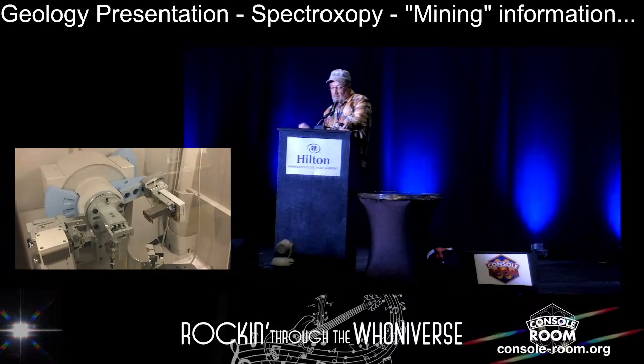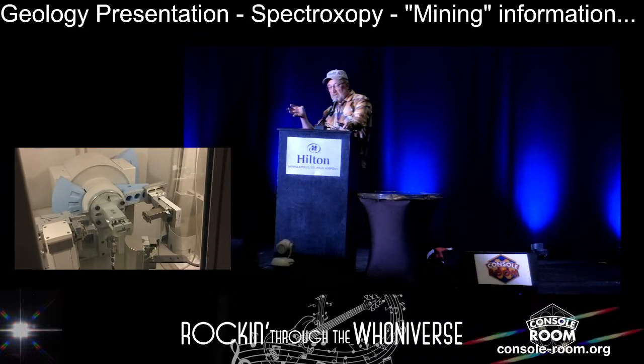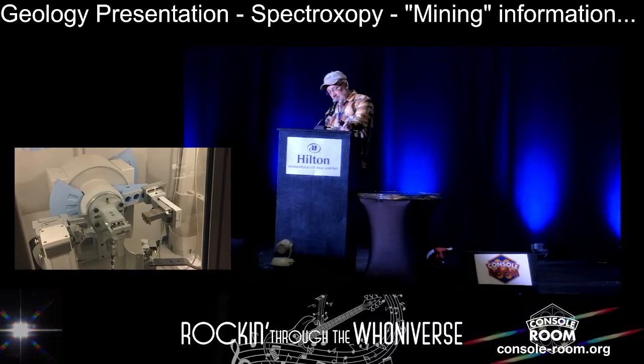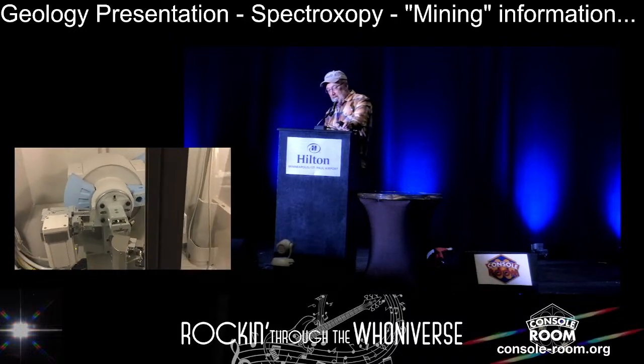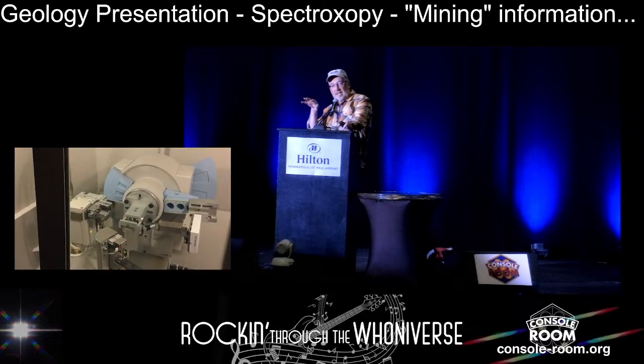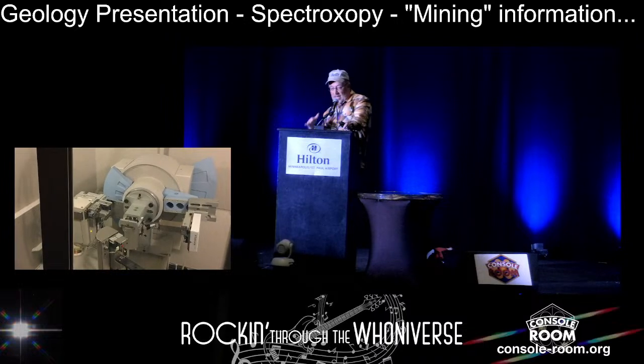the analytical location, and what you're seeing there was the detector moving down. It actually has to move up out of the way to get the sample in. And then this little light comes on, there's a click, and that's letting the copper X-rays out that are bombarding the sample at a specific angle. And we will scan through a range of what we call 2 theta, and see what the results are that we get.